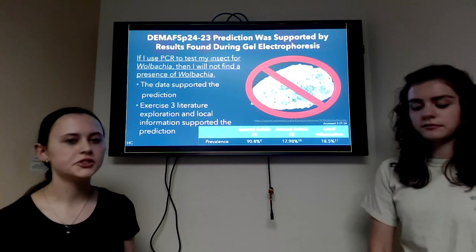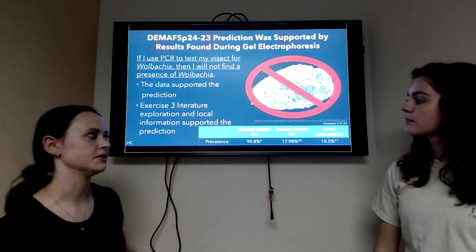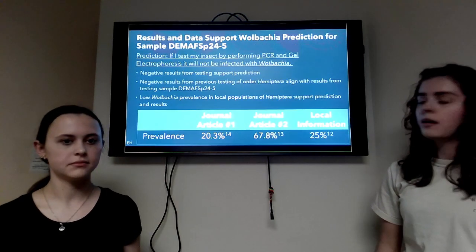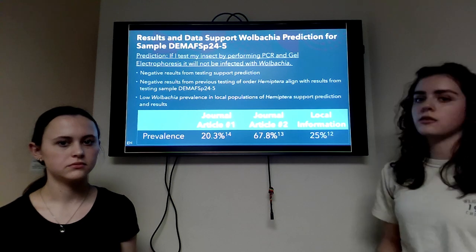And my prediction was supported both by the gel electrophoresis and the scientific literature review that we did. My prediction was also supported by the scientific literature and the gel electrophoresis.